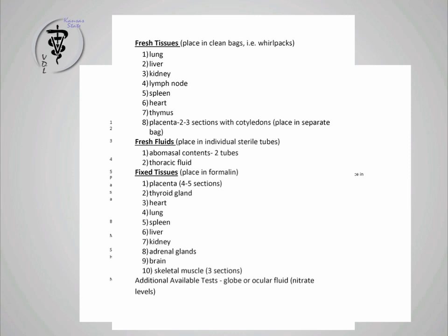So all these fixed tissues in formalin, brain, I mentioned that we typically don't get it. It is really important in the case of Neospora. So especially if these are late-term abortions, we would really like some brain. The only lesions it's going to cause is multifocal necrosis in the brain, and occasionally it'll cause some myositis in both cardiac tissue and skeletal muscle, but more commonly we see the brain lesions. So I'll mention that we don't get it very often.